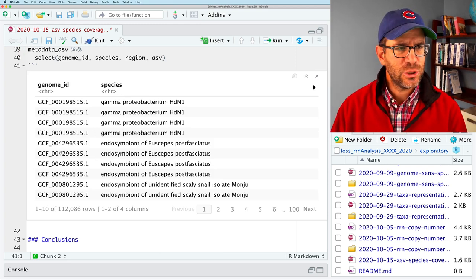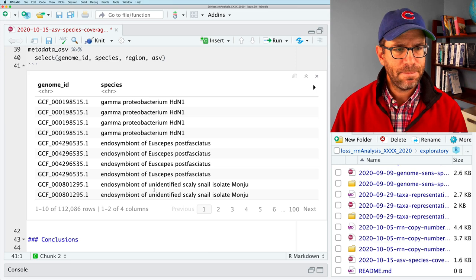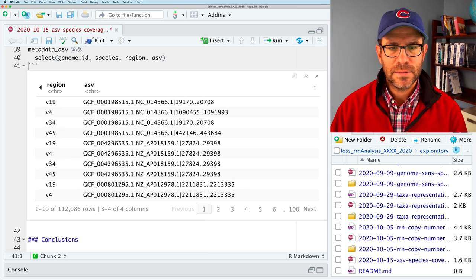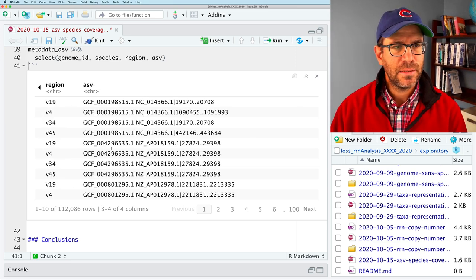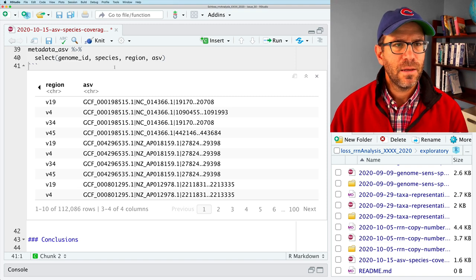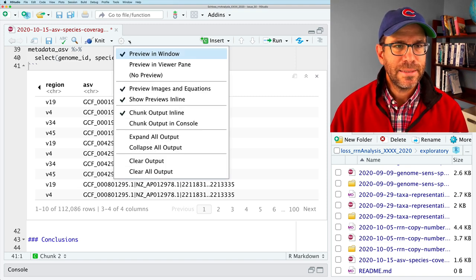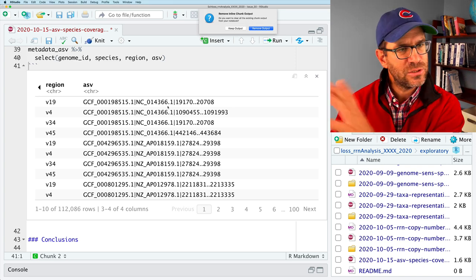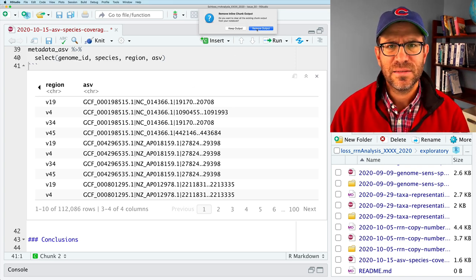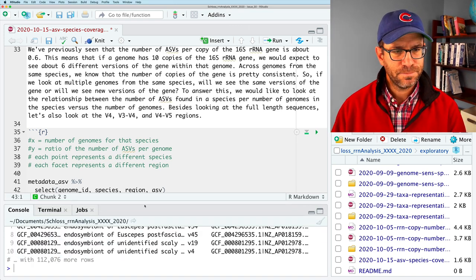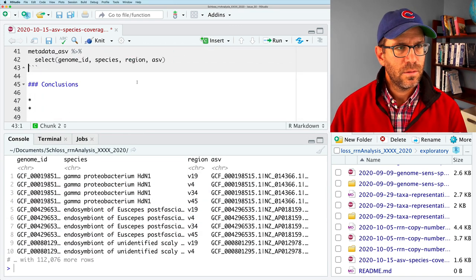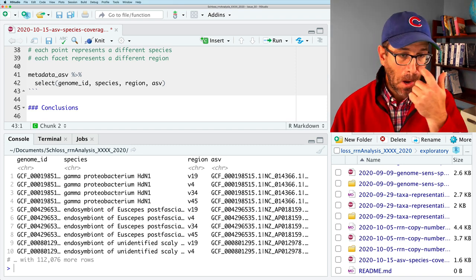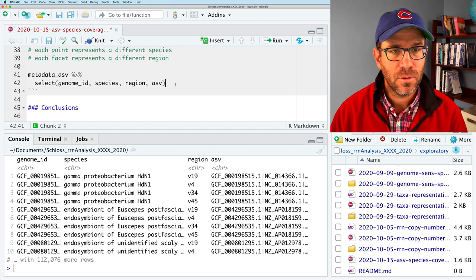And I want region. I want the ASV and I want, do I want the count? I don't think I want the count. Because that tells us how many times each ASV shows up in each genome. And I'm not really interested in that. I'm purely interested in the total number of ASVs, not their frequency.